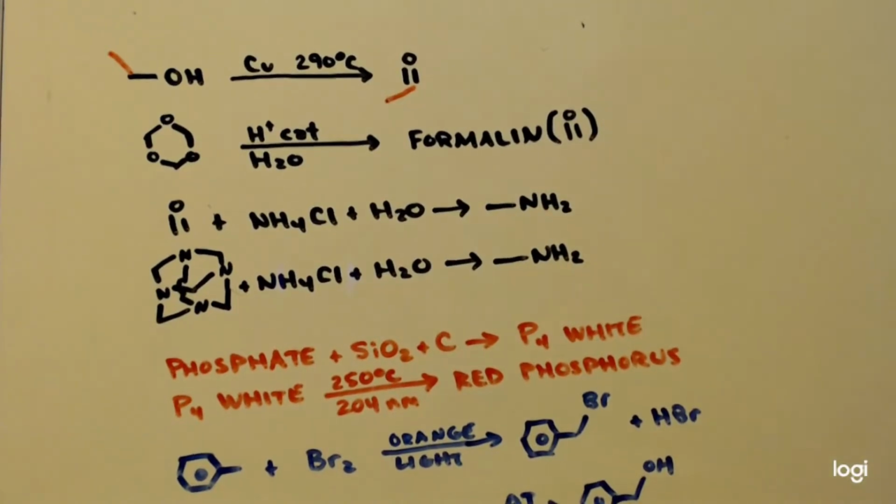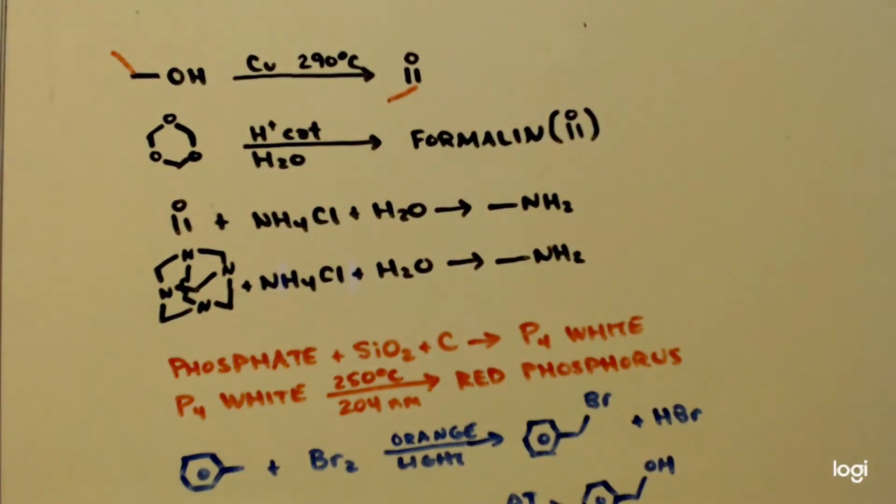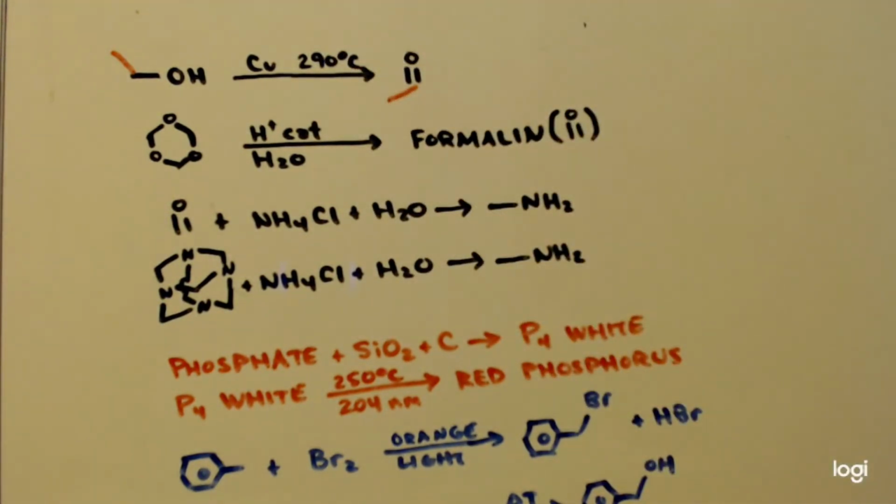So keep in mind, these equations aren't balanced or anything. But I figured it out. The first 2 times, like I said, I got 8 milliliters doing this with the copper and the ethanol. And the first 2 times it worked, and I tried to tweak it, and I tweaked it the wrong way, so I kept getting worse and worse. So this time I know what to do, tweak it the other way. Plus I bought more equipment so I can have better control over the temperature instead of just guessing and throwing a whole bunch of heat on there and hoping it's going right.